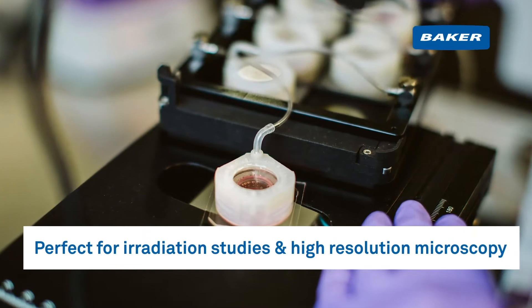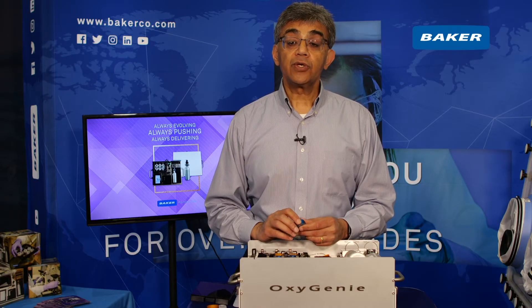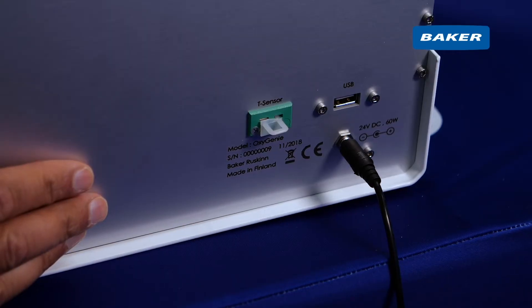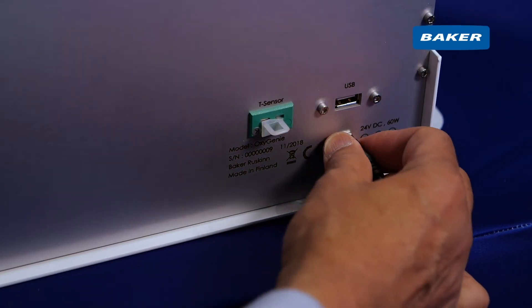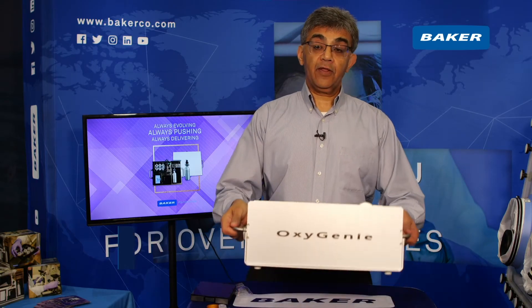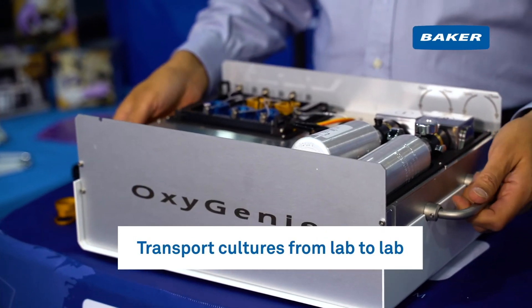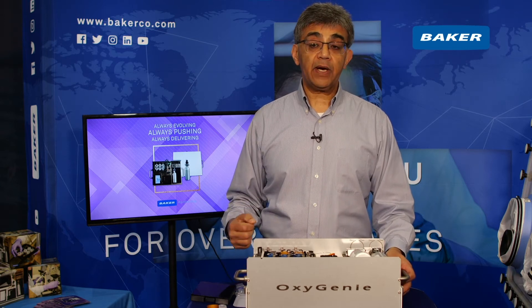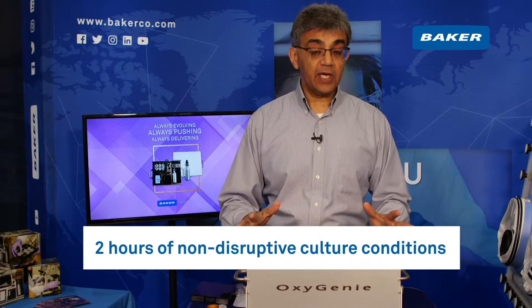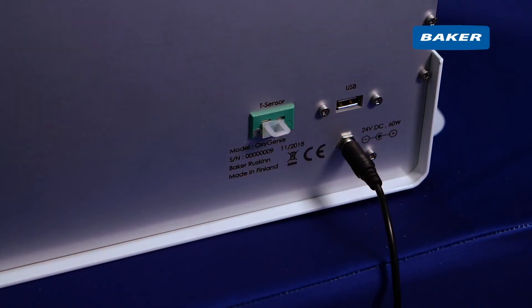One well sample cups can be placed individually or together into an irradiator or onto a microscope stage. For an experiment requiring irradiation and/or microscopy post culture, you can unplug Oxygeni from its power source — a simple DC power cable — and carry the whole Oxygeni system from one lab to another. The onboard battery cuts in immediately when you remove the power cable, giving you two hours of battery life, with everything maintained under the correct culture conditions. Simply reconnect the power when you can.